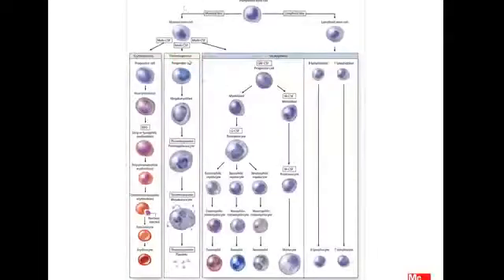All the cells differentiate and mature in bone marrow, then are secreted to the blood by a process called hemopoiesis, blood cell formation. This is the cell that originated and differentiated in bone marrow, and finally, when it is fully differentiated, goes to the blood vessel. This part goes to the blood vessels.